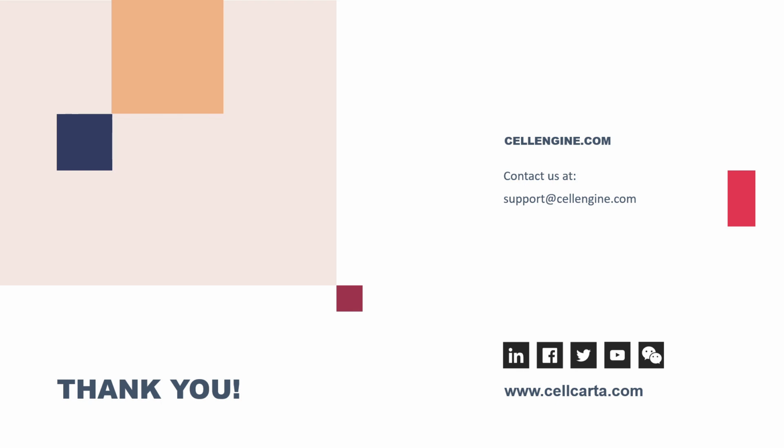Next time, we'll talk about plots that group files together: bar graphs, box plots, line charts, dose response curves, and heat maps. We'll talk more about picking exactly the subsets of files you want for a particular figure and how to manually or automatically assign colors to different variables.